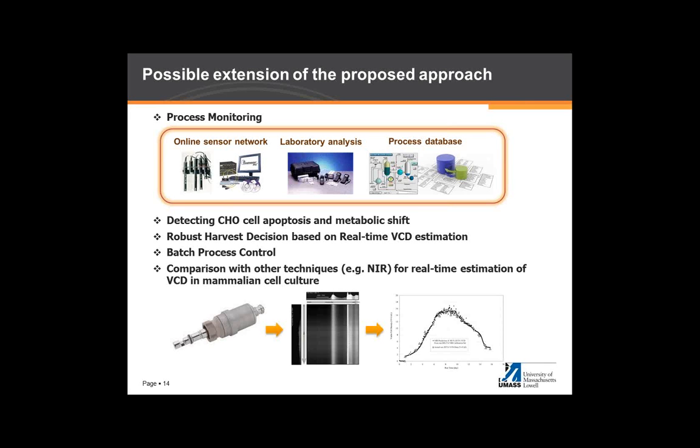And also, lately, we're looking into this dielectric spectroscopy data together with near-infrared information, to see if there is any complementary aspect between those two different spectroscopy technologies. And in the last few years, RAMAN spectroscopy has been very popular in the biopharmaceutical industry.